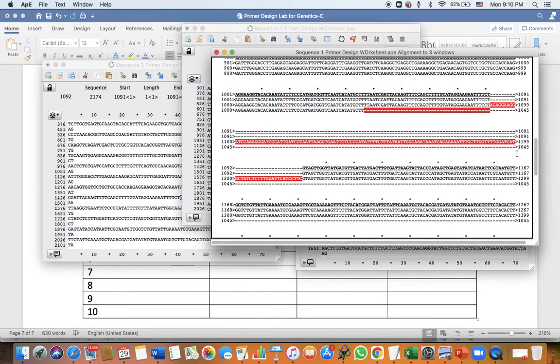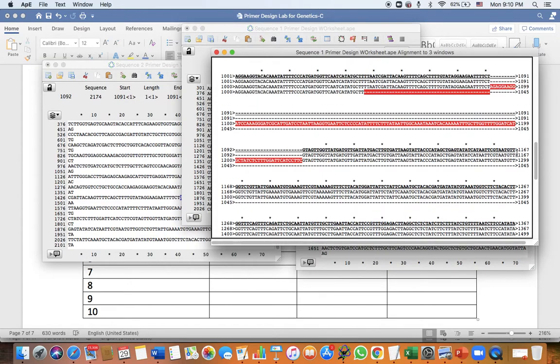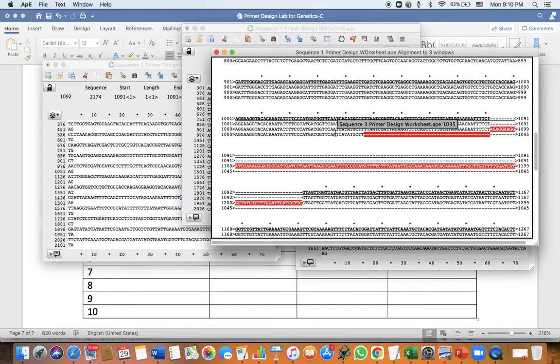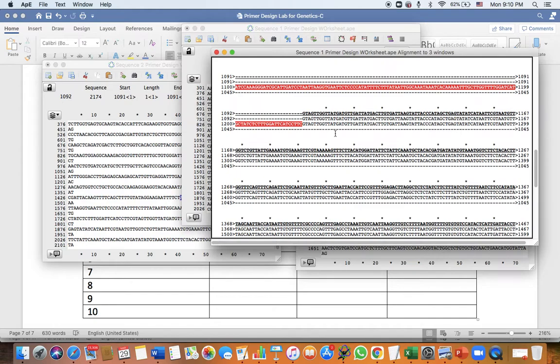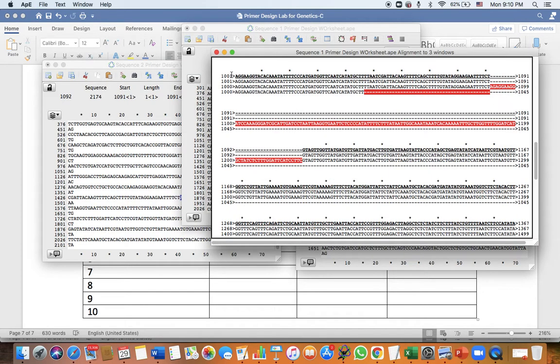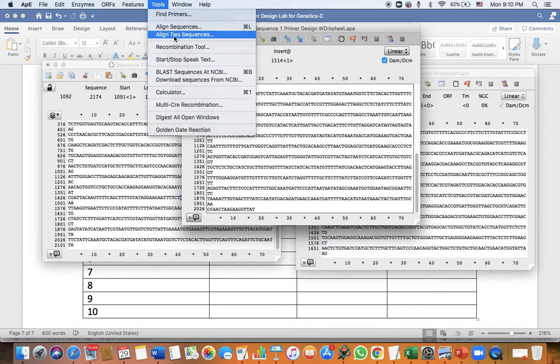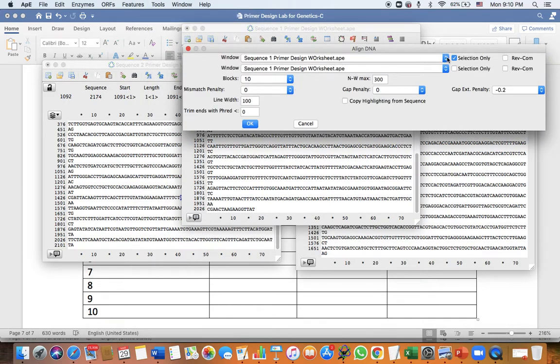And so now, since we know this is where the deletion is, I want you to be able to use your alignments now. You could use alignments to do either finding or fully interpreting what the deletion is, or fully interpreting where the insertion is. I'm not going to give this away fully, right? So let's do another example. Let's just align two sequences here. Say I go, for example, I'm aligning sequence 1 and sequence 2.